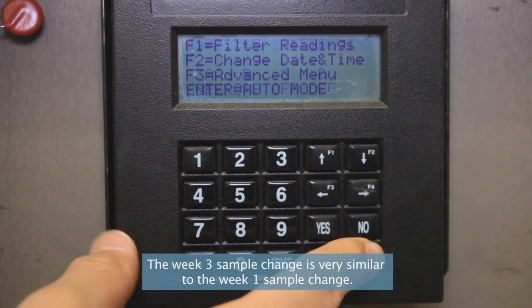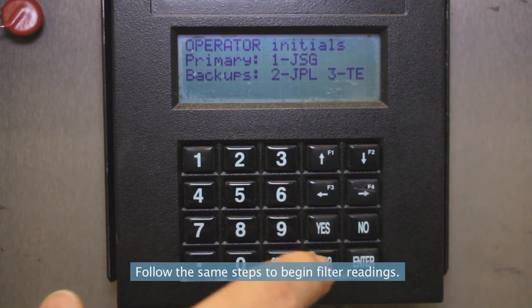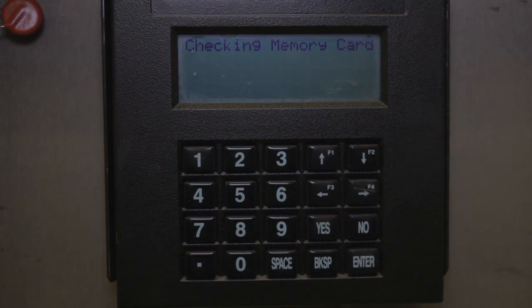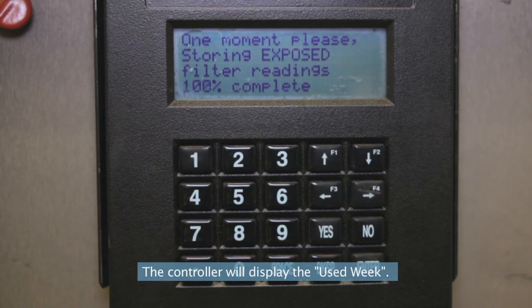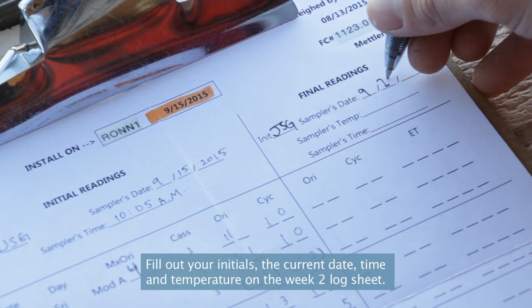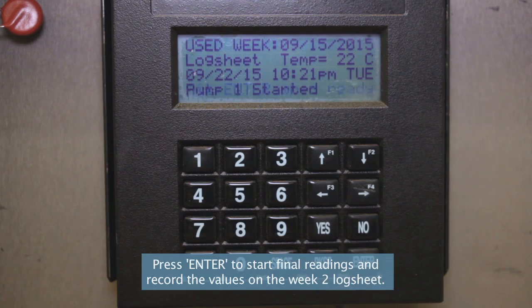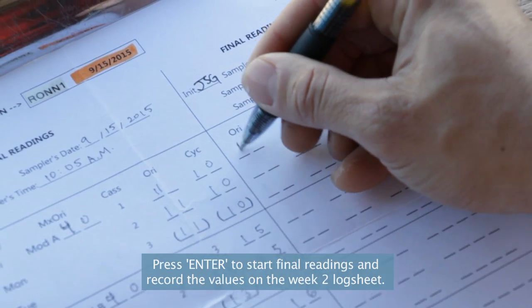The week 3 sample change is very similar to the week 1 sample change. Follow the same steps to begin filter readings. The controller will display the used week. This is the date week 2 cartridges were installed. Fill out your initials, the current date, time, and temperature on the week 2 log sheet. Press enter to start final readings and record the values on the week 2 log sheet.